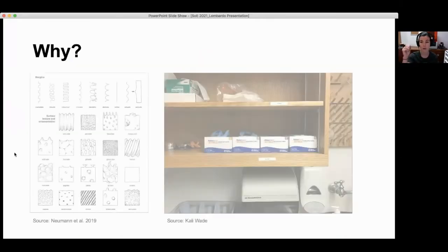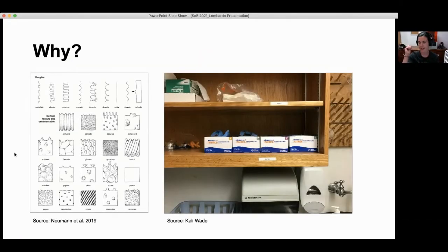So why are we talking about processing methods? There have been a few advances in the last 15 years in phytolith research and how to process your soils. We have clearer and more standardized identifications, but a lack of standardization for our processing protocols. This is largely due to the varied nature of the sediments that you get your phytoliths from, but it doesn't mean that protocols can't be transparent. So the goal for our presentation today is an eventual short methods paper on how to make our processing methods very transparent. You can go ahead to the next slide.